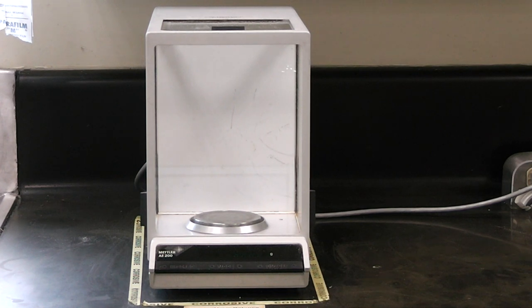Therefore, you must be much more careful when using the analytical balance, as the reading can be changed by even a slight gust of wind.